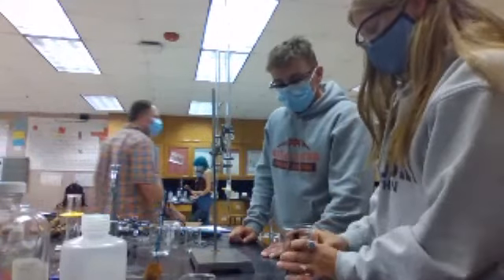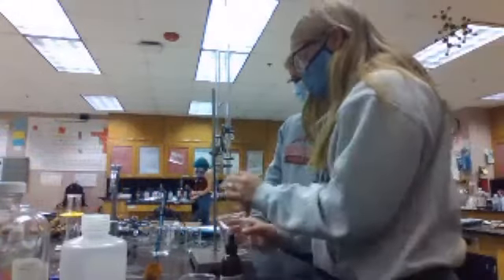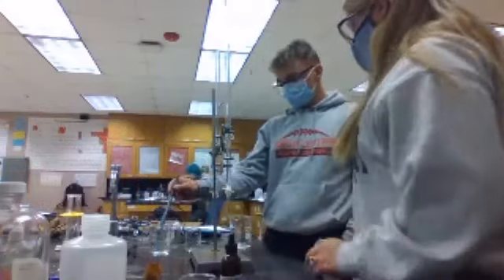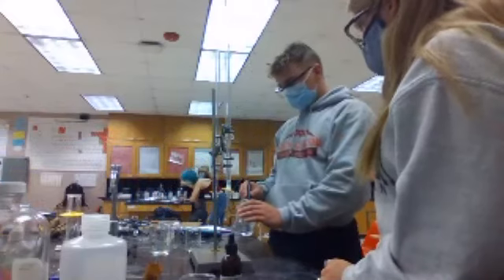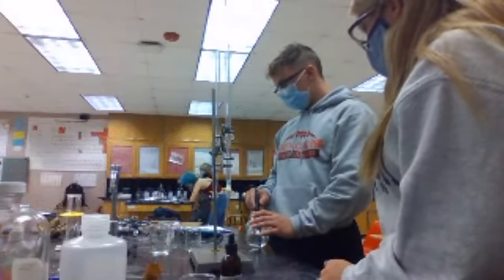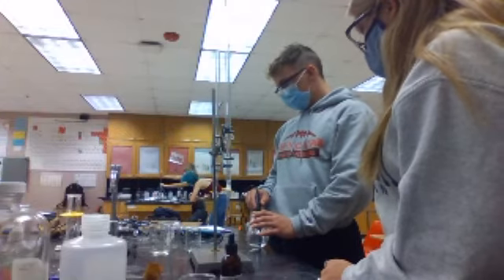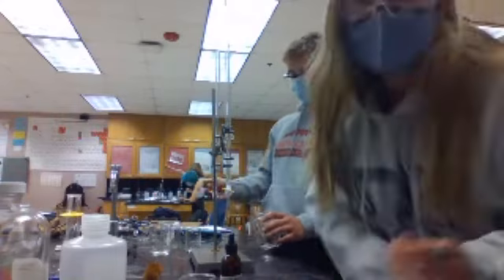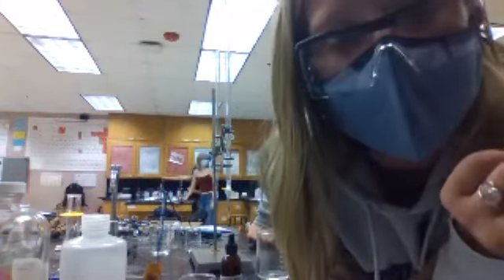What's the actual? No, I didn't take pH. So it doesn't change with the drops. I think so. I'll look it up. I've got it right there. I have it on me right now. 2.27. Okay, the pH of the acid is 2.27.